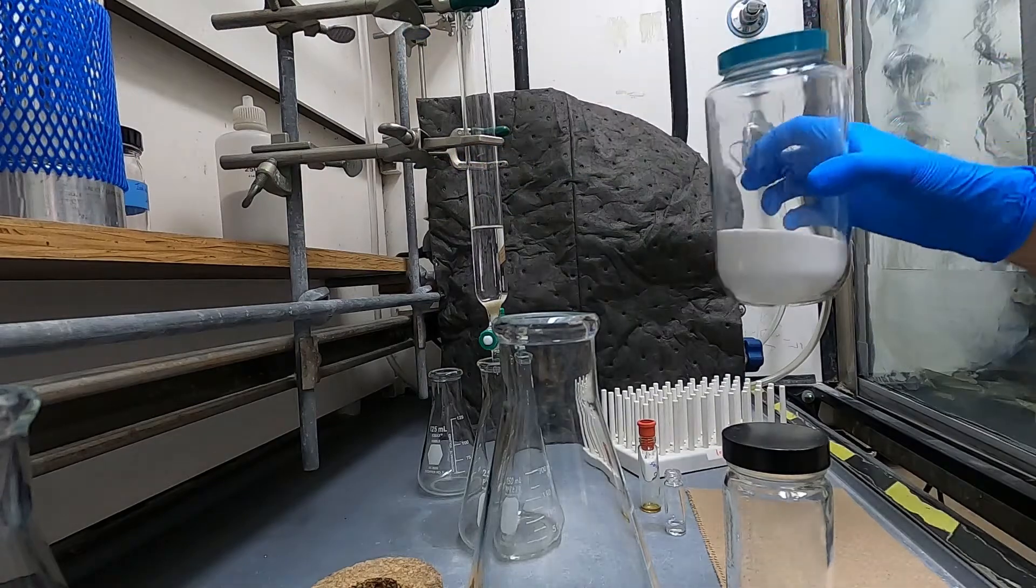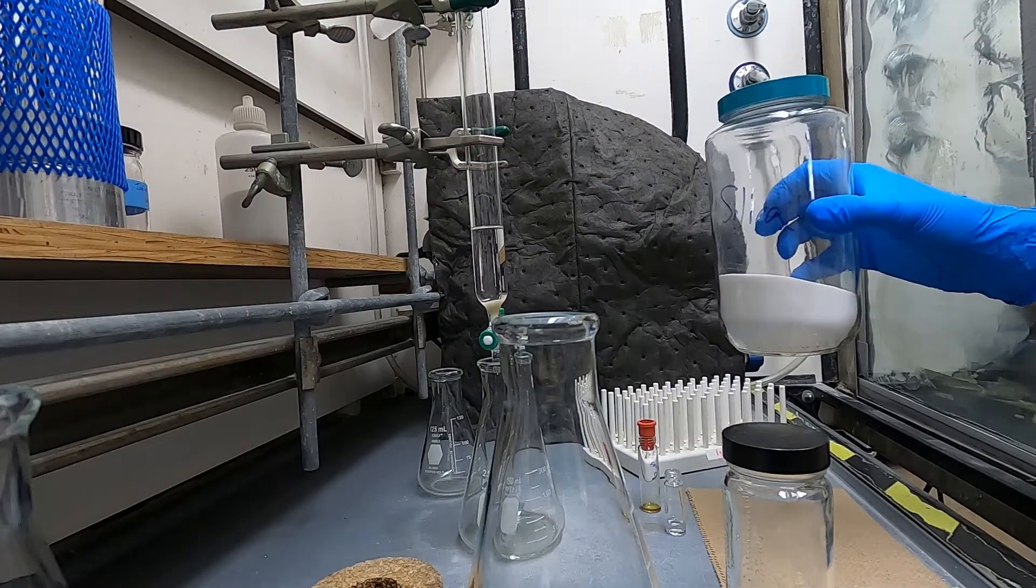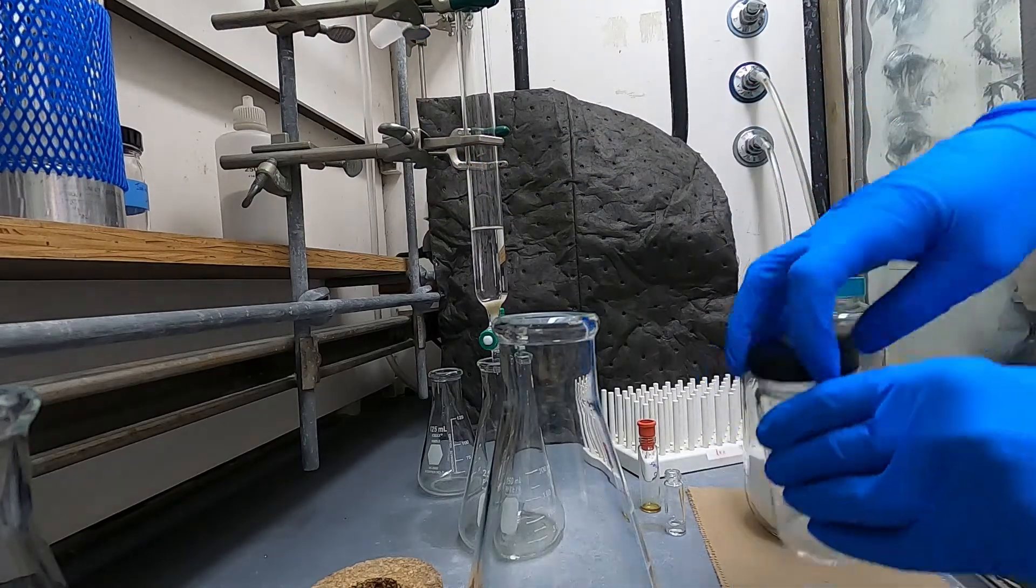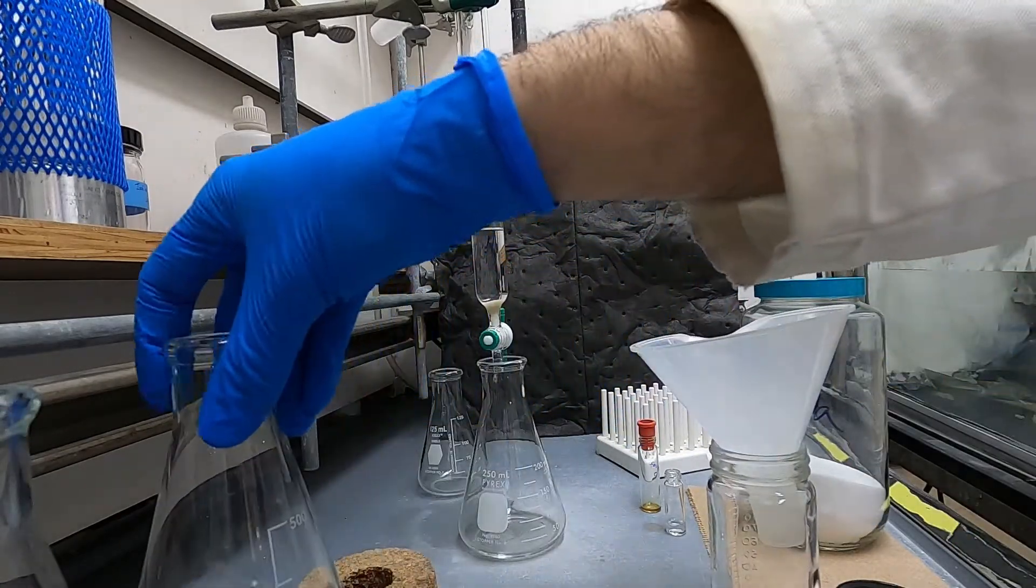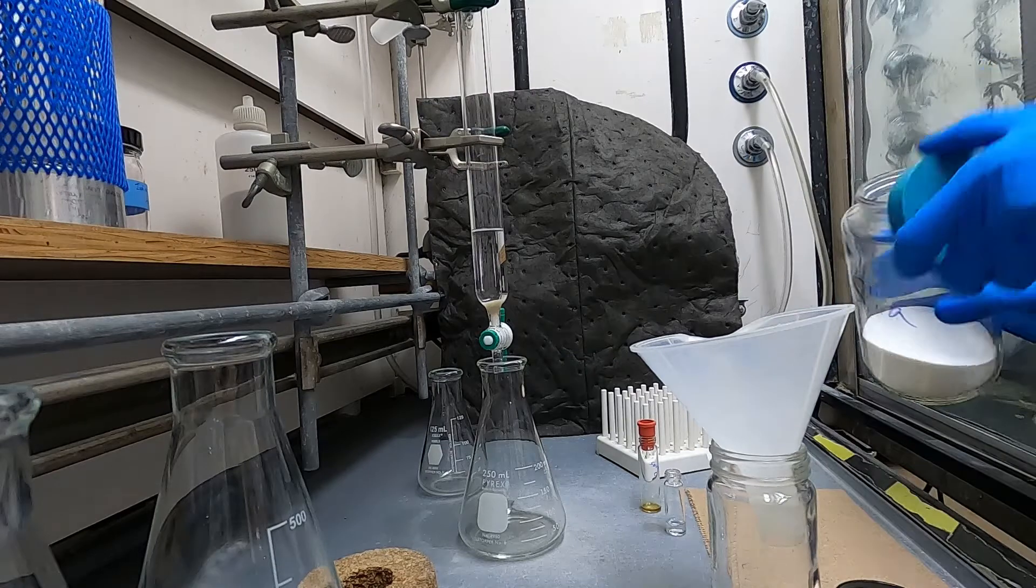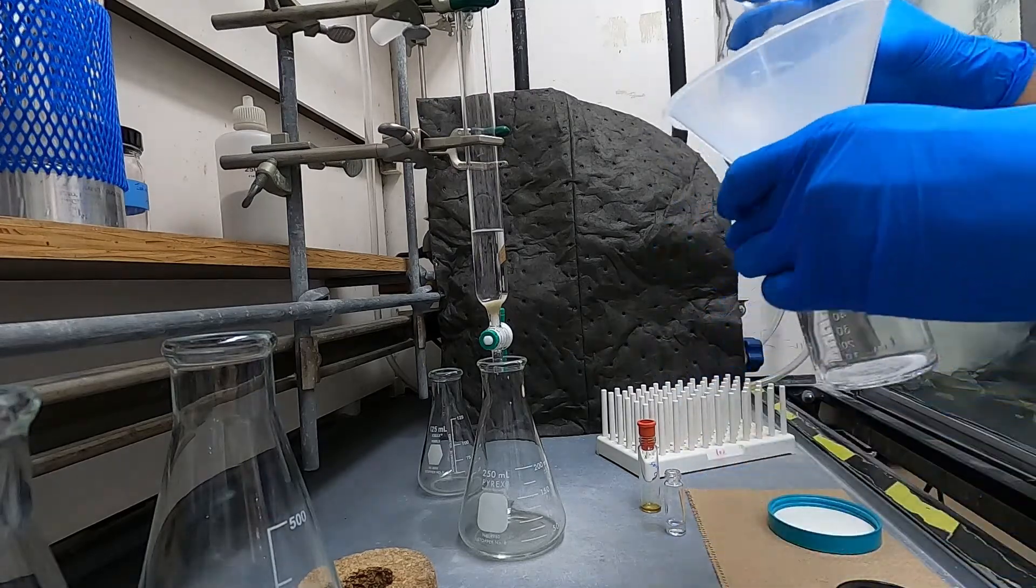And then I measure out my silica. I like to do a constant or a known amount of silica just so that I can reproduce the column conditions if I need to. So I have this little jar that has volume measurements on the side.